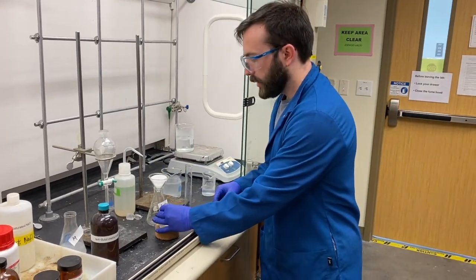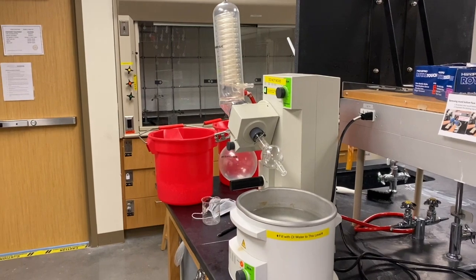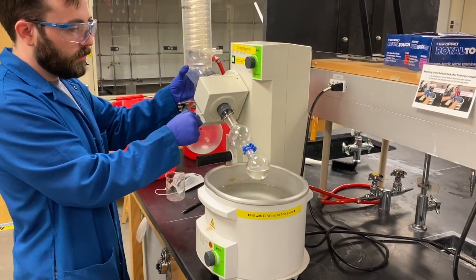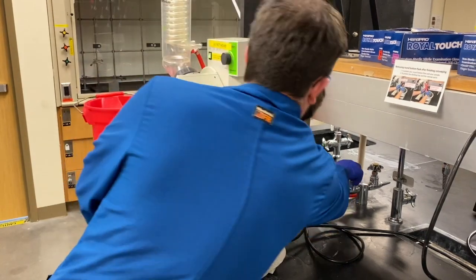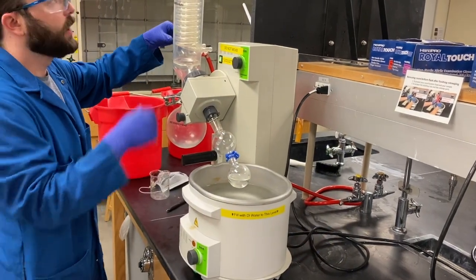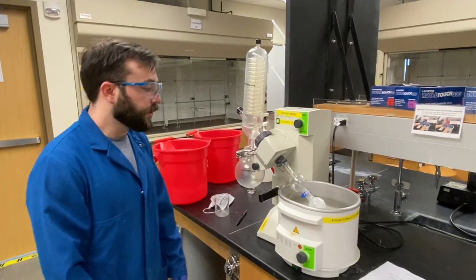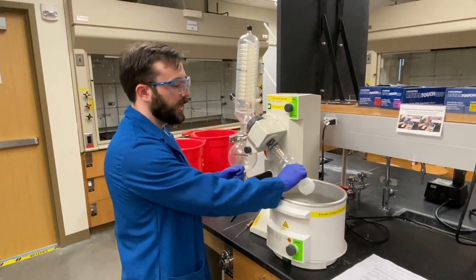After the ether has drained through, it's transferred to a rotovap and connected with a keck clip. The vacuum is turned on, the rotation is turned on, and the solvent is slowly evaporated. After the solvent has been evaporated, the round bottom flask is left with a white solid.